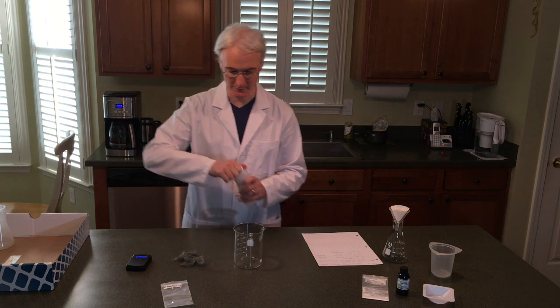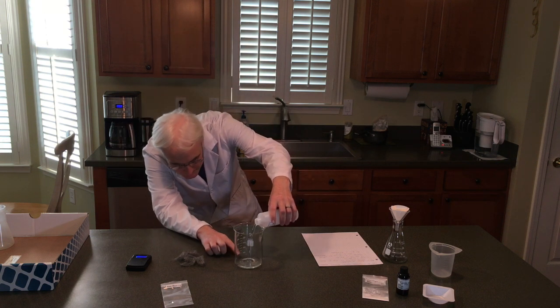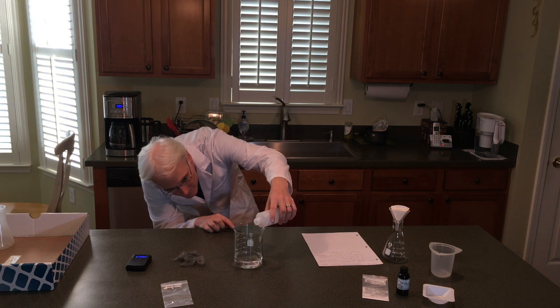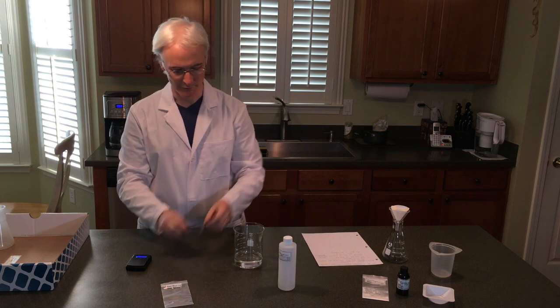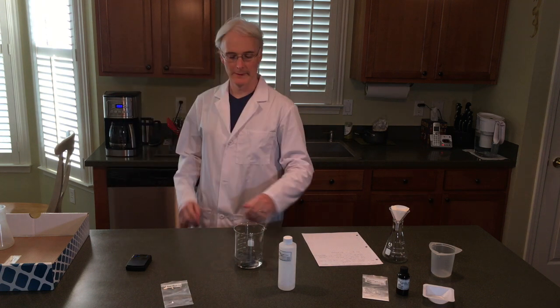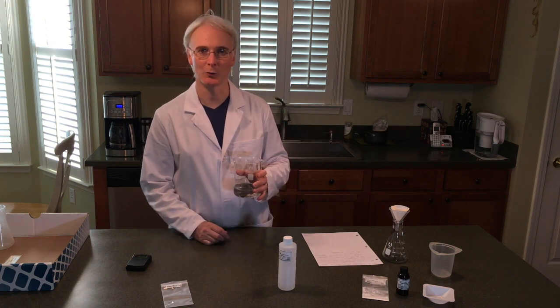Pour 150 milliliters of acetic acid into the beaker. Put the steel wool in there. And now we're going to take the beaker over to the stovetop and put it in a pan of water.